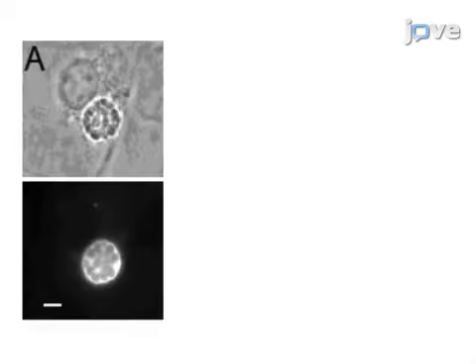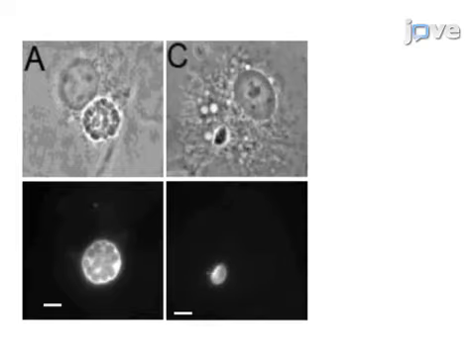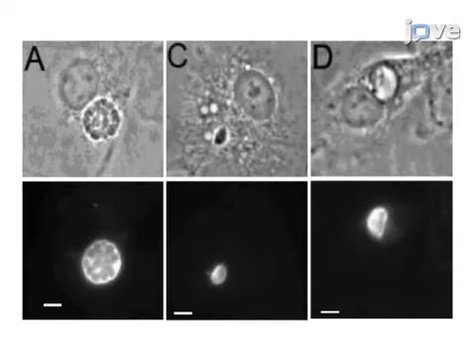Ultimately, immunofluorescence microscopy is used to show the mutant parasites replicate like wild-type parasites in unstimulated macrophages but are either unable to replicate or are amorphous following macrophage activation.